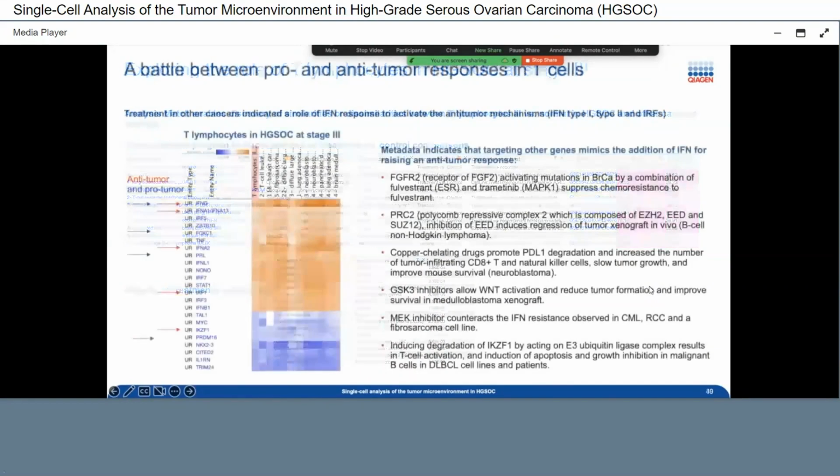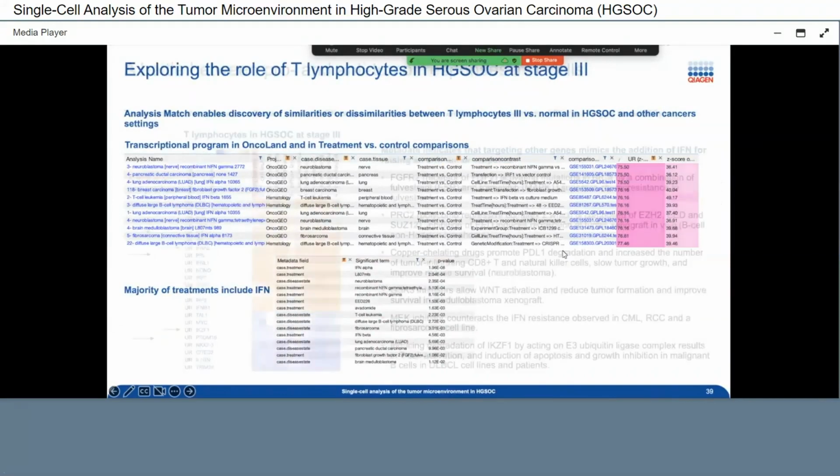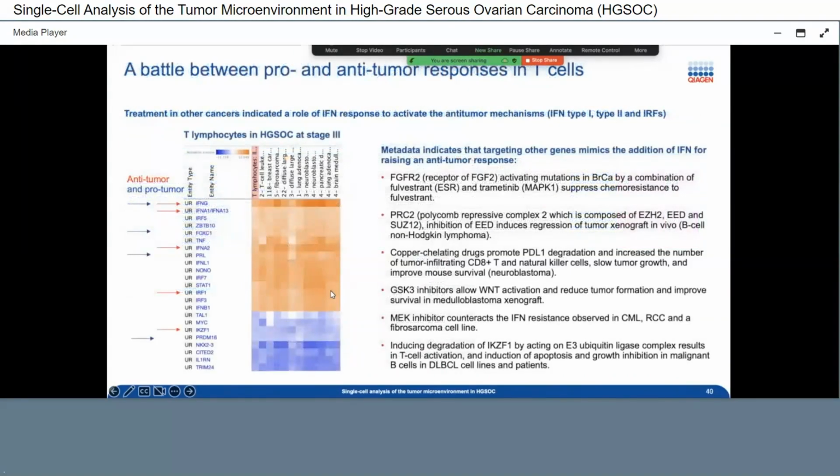Well, let's find out. So now I put these different comparisons that I've selected here, the 10, 12 you've seen here. I select that and I project a heat map. That's the heat map you see on the left, right? And that is T lymphocytes at stage 3 versus normal in comparison to many other data sets. And as you can tell, as quick things, when you select upstream regulator as the entity here, there's a clear program of activation and a clear program of inhibition for some of the upstream regulators and others, right? And the game right now is to understand what's going on here.